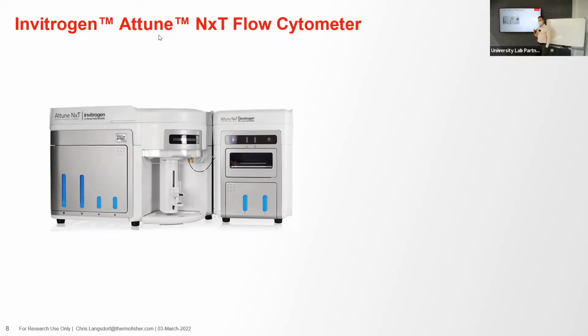And so we were mentioning that this is the original auto sampler. Last year we launched something called the Sidekick Max, where this takes about an hour and 15 minutes or so, hour and 20, to run a 96-well plate. The new one will do it in 22 minutes. So it really improves your throughput. It's not really necessary unless you're screening lots of samples. This instrument's already really fast. But if you start screening, that's something we could look at setting up here.